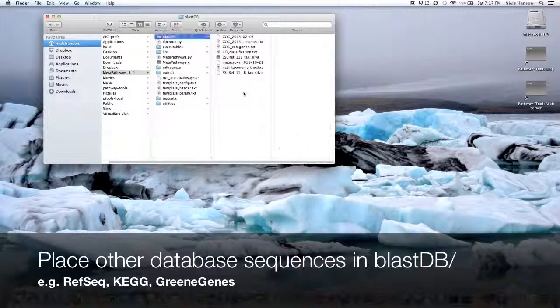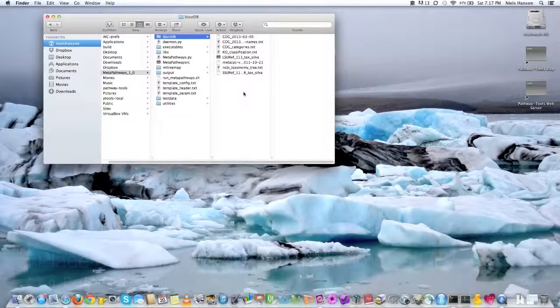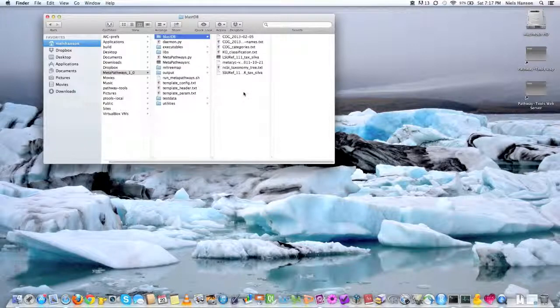And so you can essentially place any protein or any nucleotide database, and as long as you configure it to search against it when you run metapathways, it will pick it up and incorporate those results into the analysis.